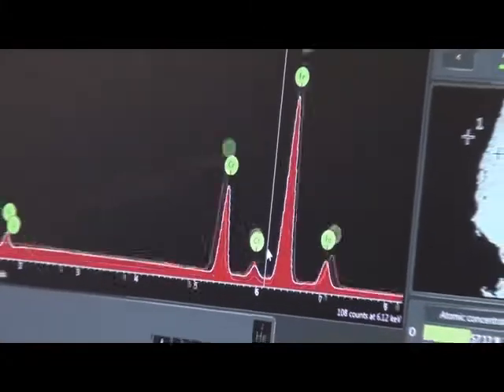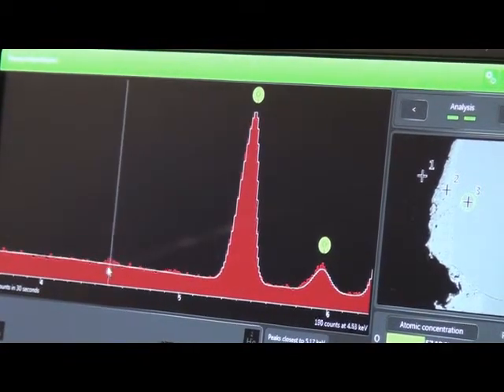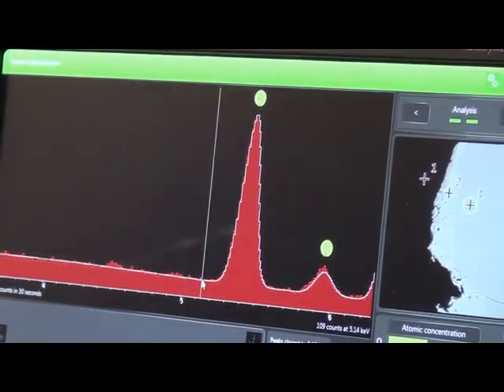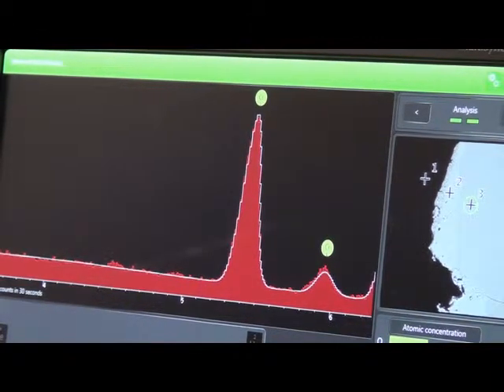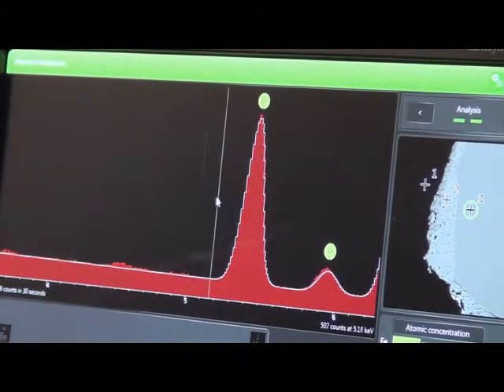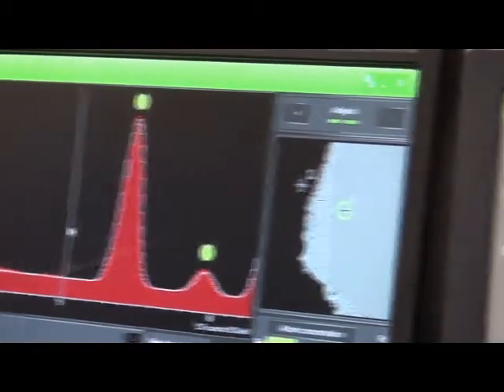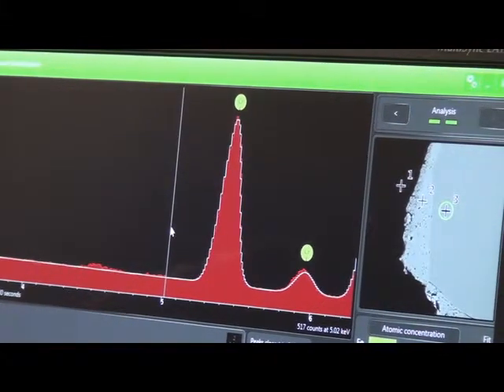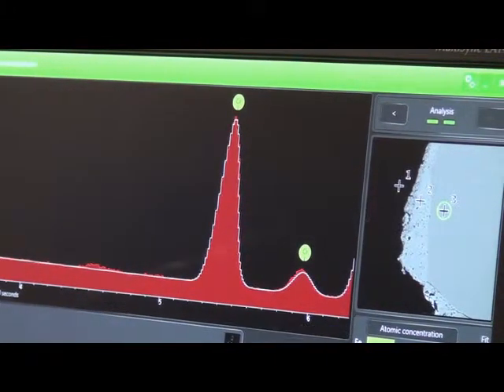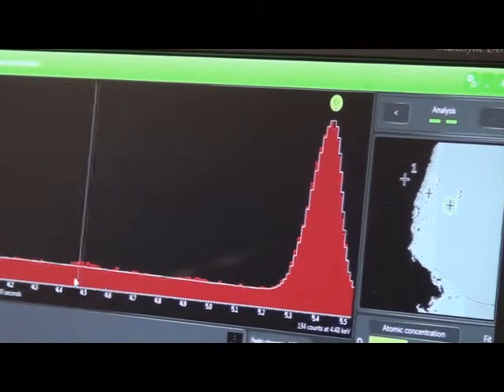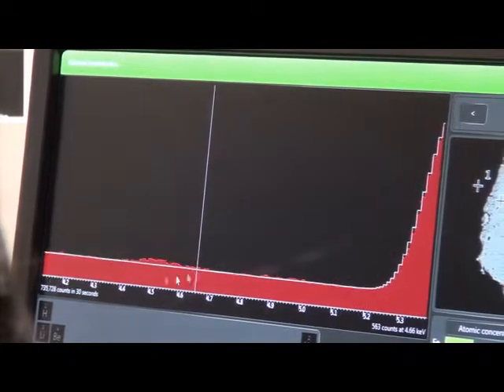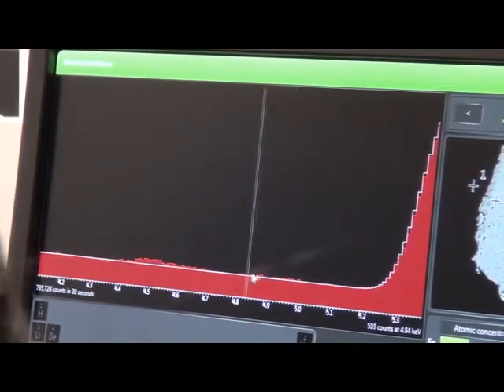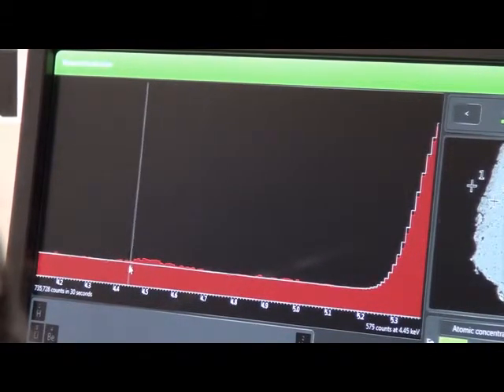What we're going to do is we're going to zoom in and just look at this for a second. So you can see here this sort of bumpy area. This is what's called the background. I've also imaged this in a slightly different setting. This setting has, I believe, about 10 times the current. So it's sending more electrons down, which means we get more x-rays out. And the reason we do that is you can see how bumpy this is here, right? We smooth that out. We have more data and that reduces what's called noise. And you can actually start to see there is actually another peak here.